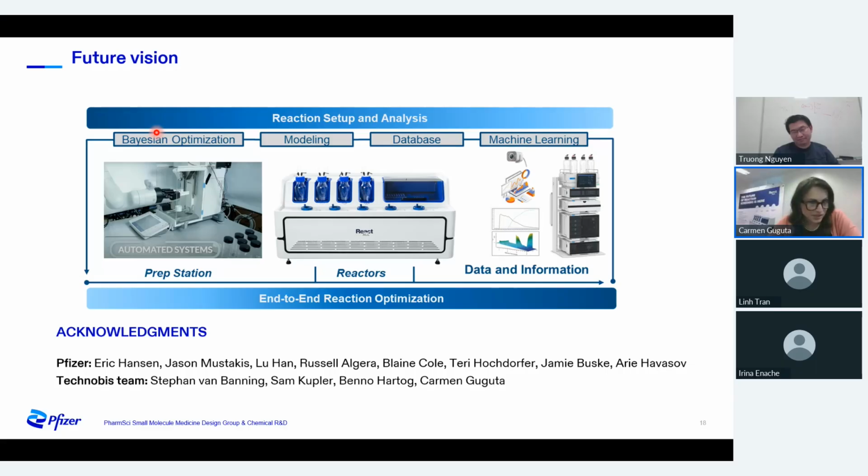Another question: what about when using heterogeneous reactions, for example with solid inorganic reagents, does the sampling line block? The short answer is it depends on your reaction. We haven't tested all different types of heterogeneous reactions, but for cross-coupling reactions, 90% are handled very well. And I think the lines are not that big of a problem.